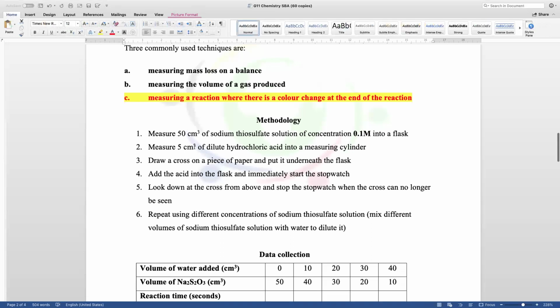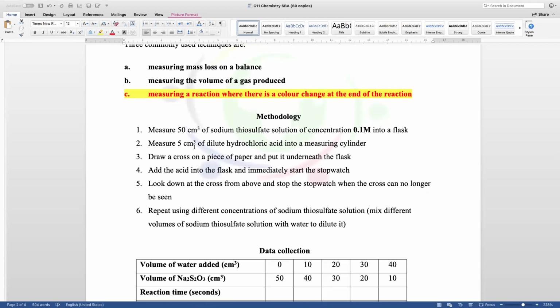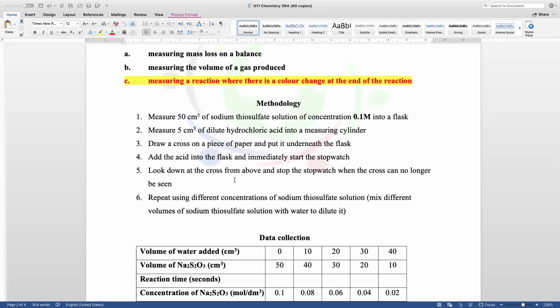This video is a continuation of the previous video that I just made, where I was trying to talk about the reaction of sodium thiosulfate and dilute hydrochloric acid. So, how is it done?